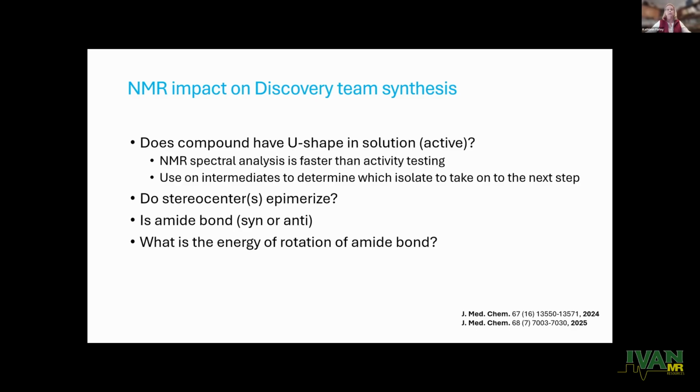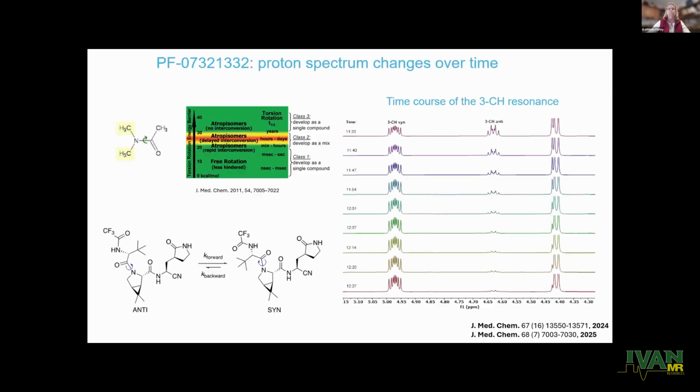It was a little slow in solution, and tended to go one way and had trouble returning back to the original state. So we'll talk about that some more. So this is just a time course now of putting the compound in the crystal state into solution and how does it change over time.